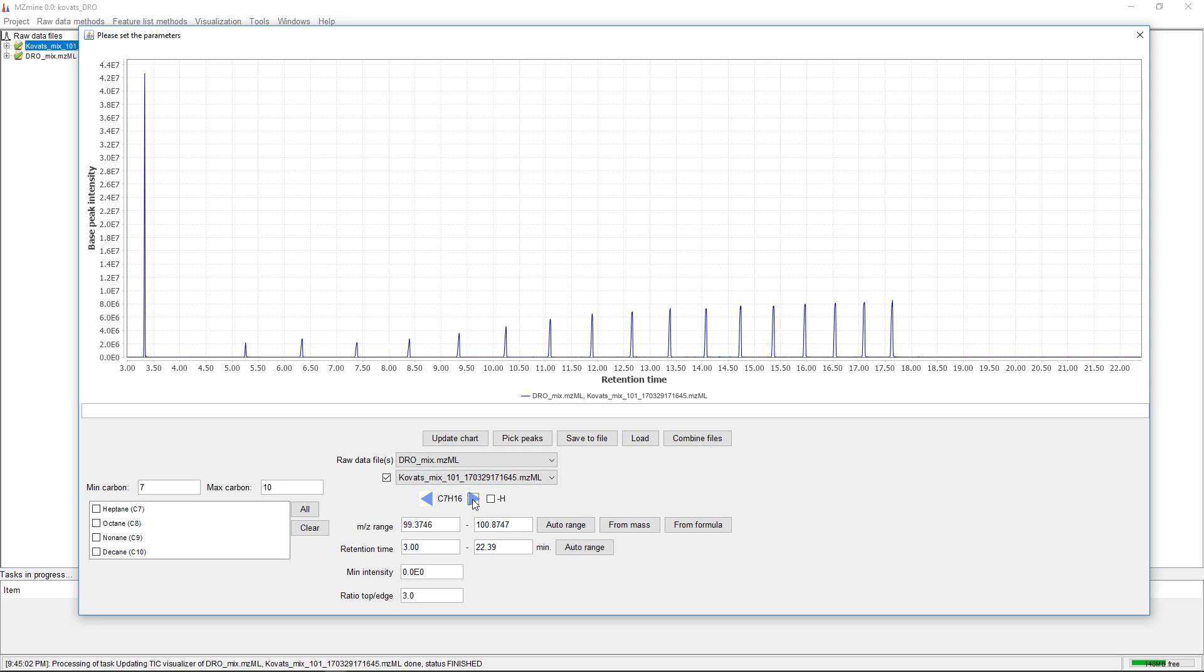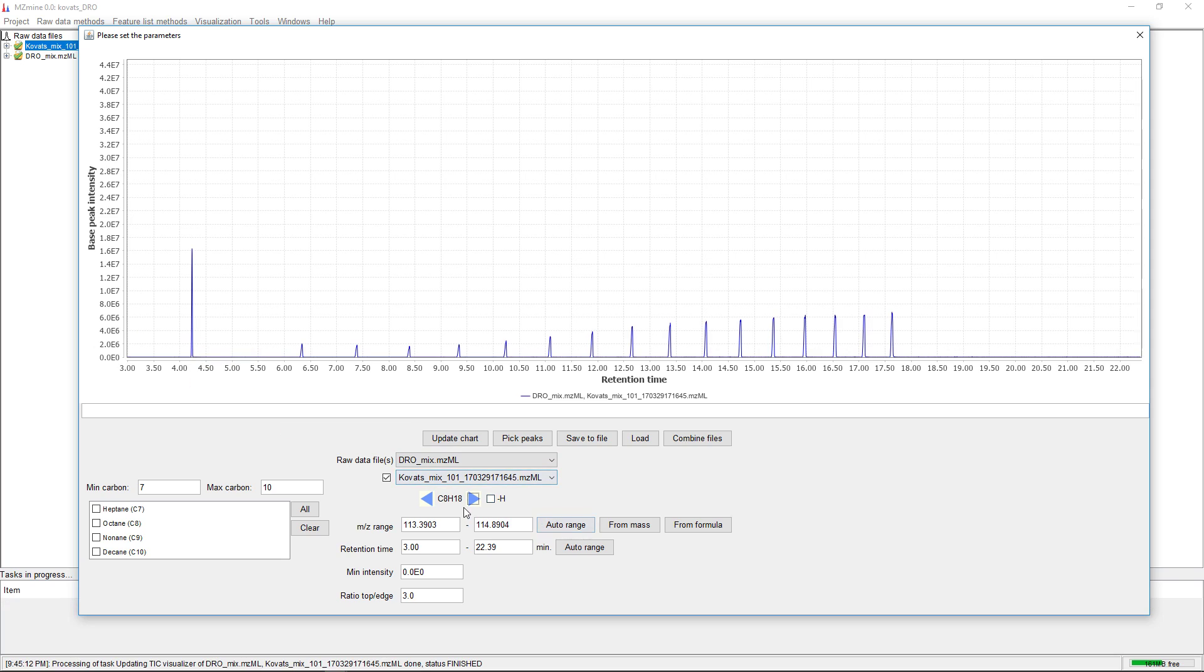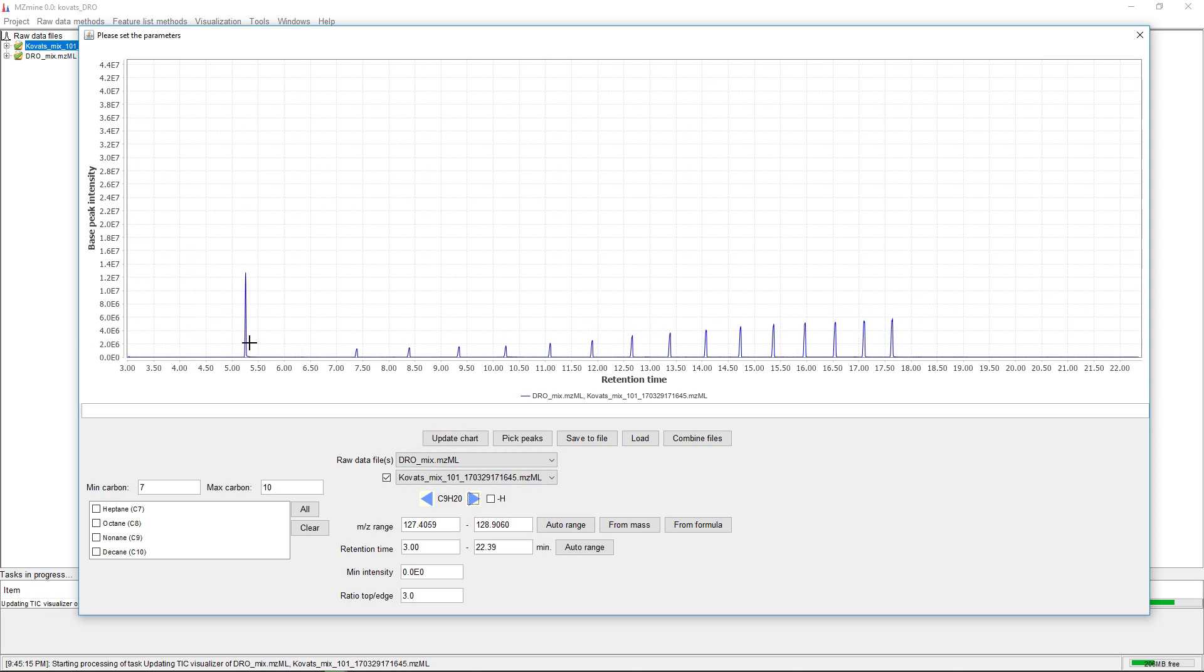Then we have C8 and C9. All these peaks correspond to the higher alkanes that also fragment down to this particular formula.